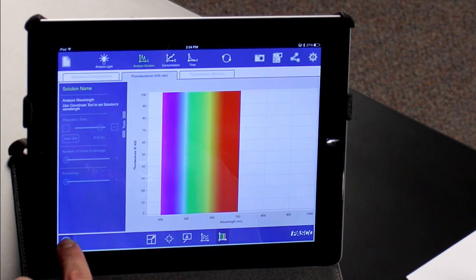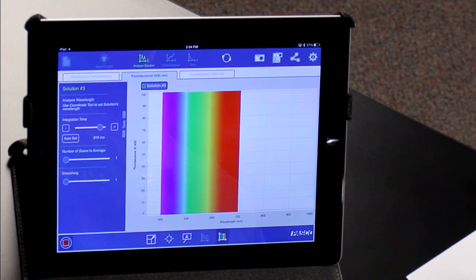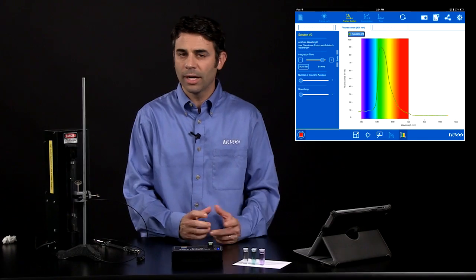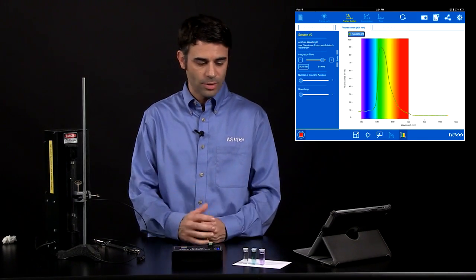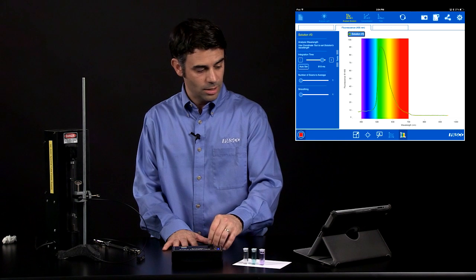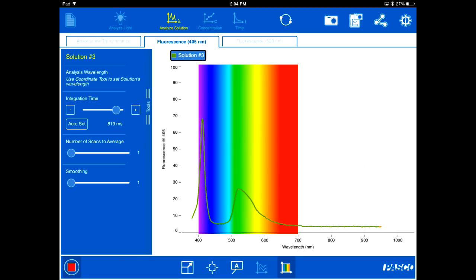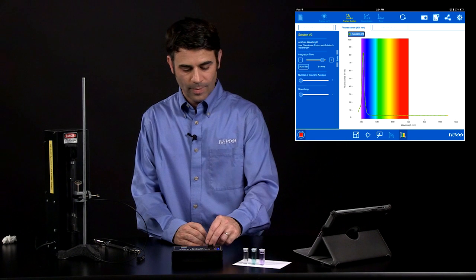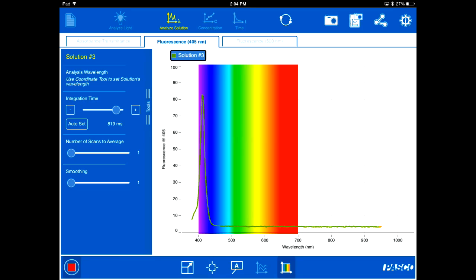I'm going to hit start. My integration time was already pretty high. If it wasn't high enough, I could do autoset integration time again and it will find the best integration time. And the nice thing about this, a neat thing to show is that if I take the sample out, you can actually see the intensity of the fluorescence LED, the excitation LED at 405 nm. And when I put that back in, then you can see that that peak goes away because all that energy is getting absorbed. And now the sample is fluorescing in the 550 nm range.